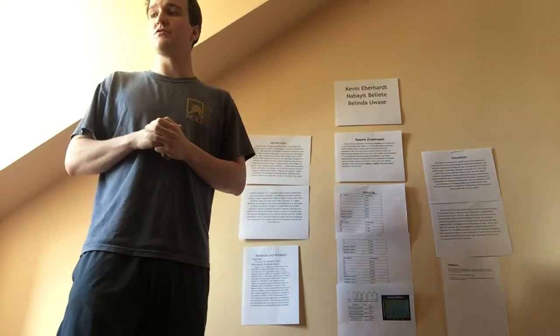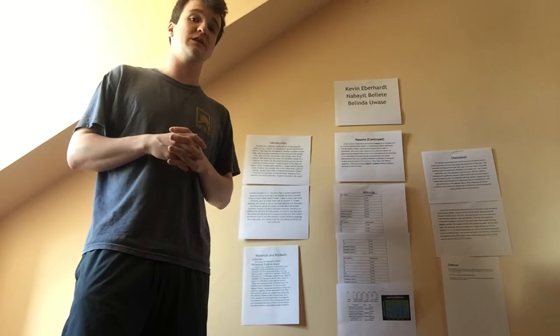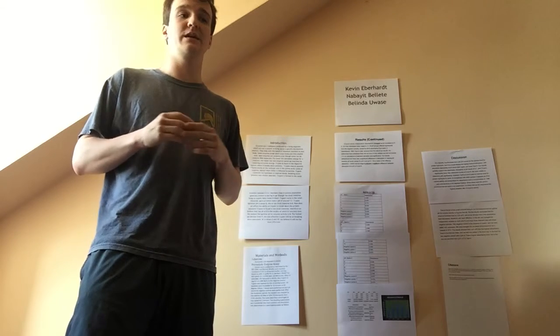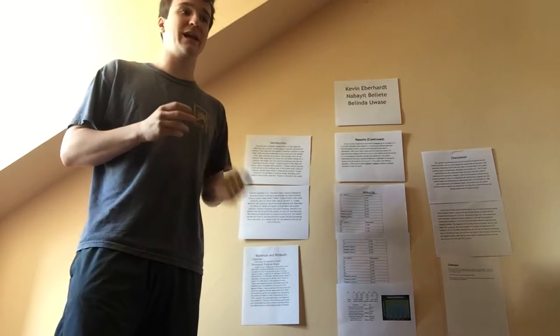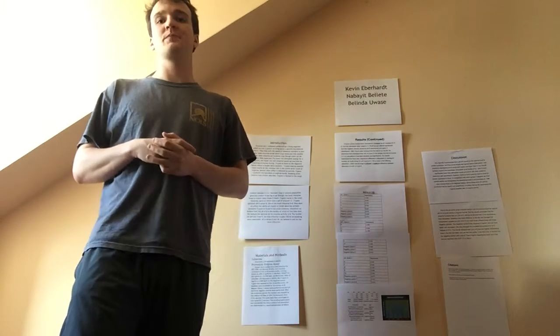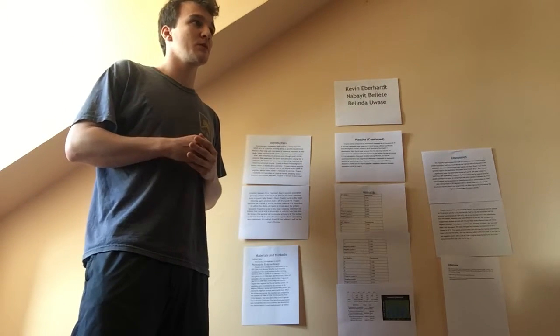Now, in our case, we studied whether or not trypsin would break down azocasein, which is a milk-based protein that has had an azo dye added to it so that it's easy for us to read our results. And I will get to that in just a moment. But first, what was our question? Our question was, what is the optimal pH for trypsin to hydrolyze proteins?